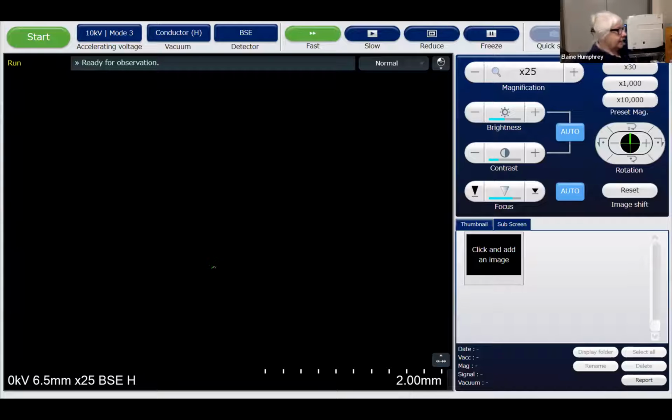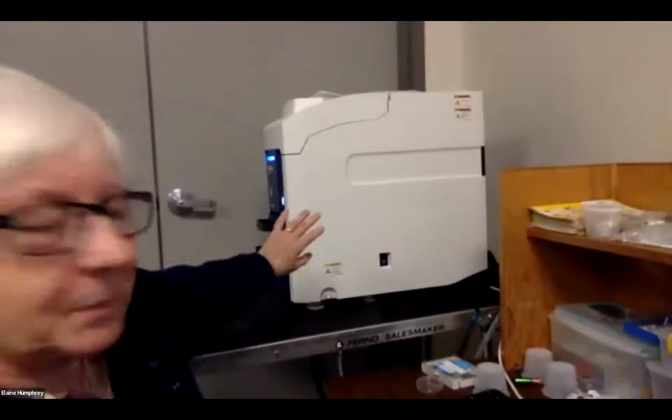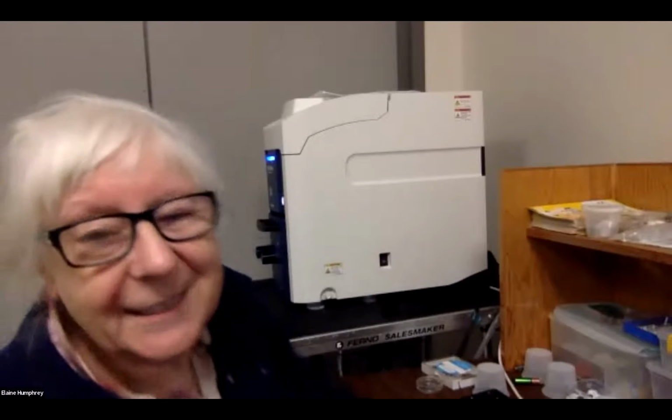So you can all see the SEM screen, and I hope you can all hear me. Maybe I should stop sharing there so that the screen that you see is the big screen, so I can show you this tabletop scanning electron microscope. Hitachi gave me this microscope for school programs, and it goes into schools. And I took it out to Galiano for a community event.